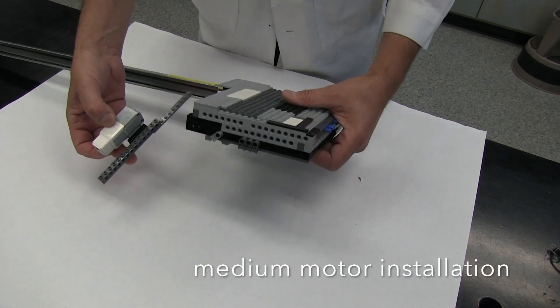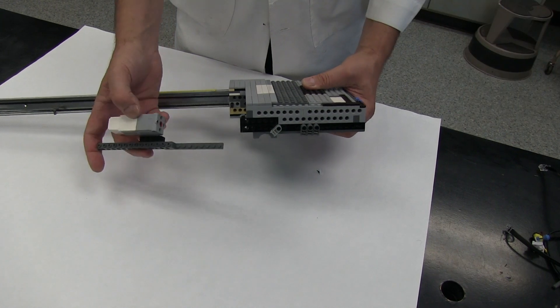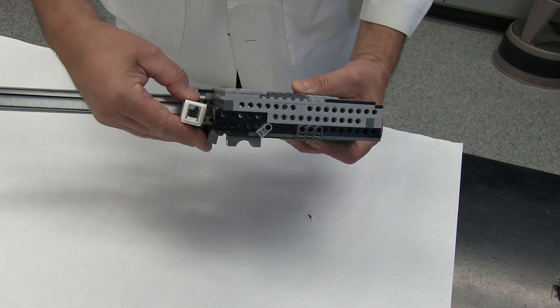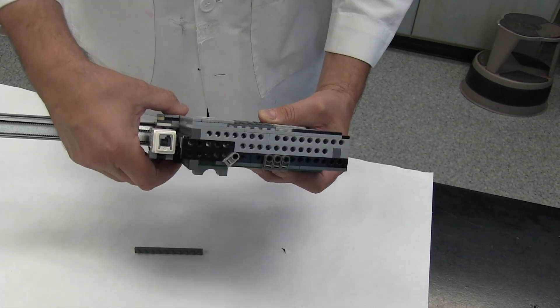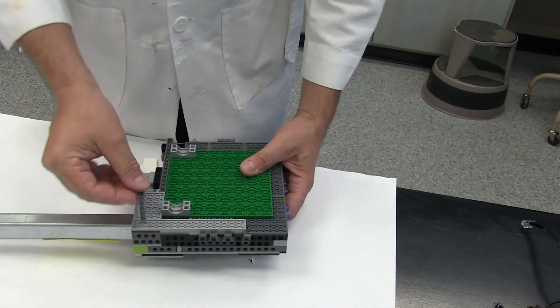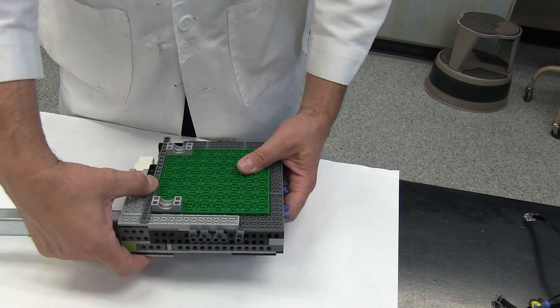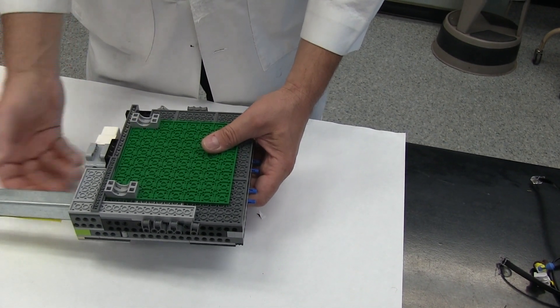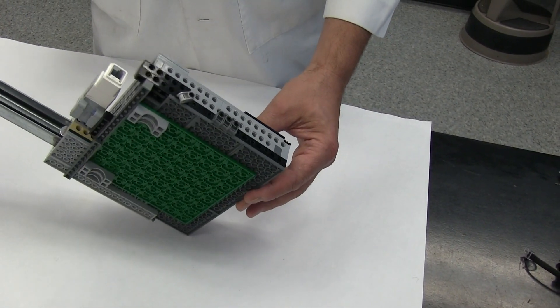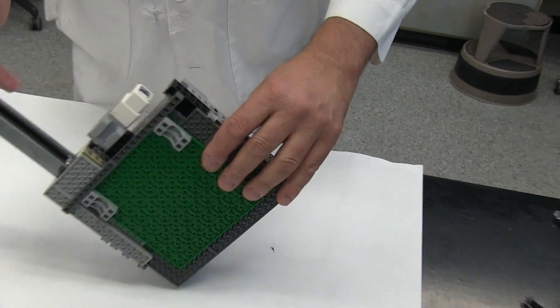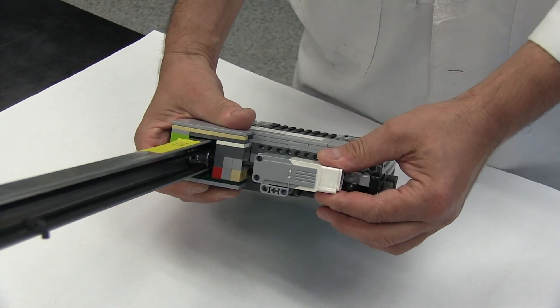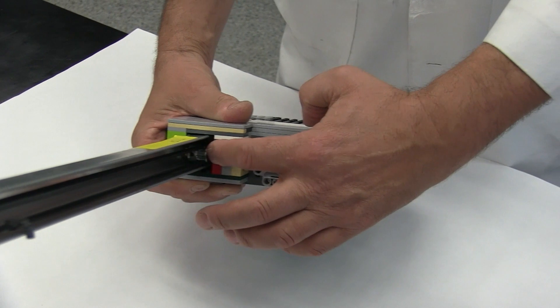In this next step, we will install the medium motor into the shaft that is connected to the pulley. You can see that the motor is connected to the shaft and the pulley. We add an extra piece on the bottom of the unit to ensure that the motor is securely placed. Here you can see how the medium motor is securely affixed to the pulley unit.